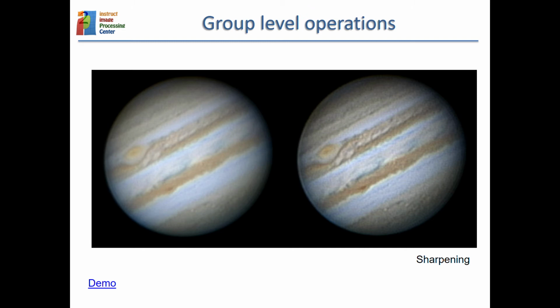And one nice thing of convolution is that it is not always a bad thing. We have seen the microscope is convolving, so that is bad because we would like to have access to the perfect image. But if you are able to design your kernel in a proper way, the high resolution information that you have lost, you are able to recover it. And that is actually what is done when you perform a CTF correction.